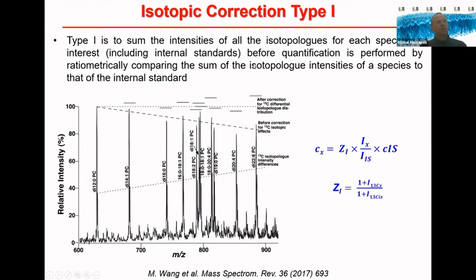And the second feature, isotopic correction type 1, is explained here from this paper of Jianking Han: if you prepare an equimolar mixture of all standards, then for higher masses you have a higher contribution of M+1 and M+2, which results in the intensity of M decreasing. It follows this pattern. So after this correction factor, it will again be equimolar and identical, as it should be. Without this correction, you again report incorrect concentrations. So both of these features are implemented.